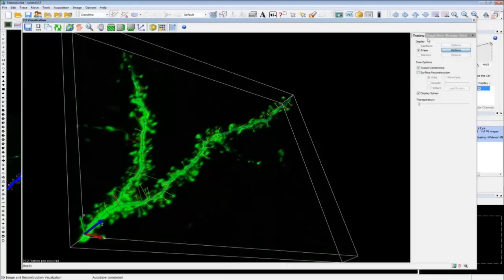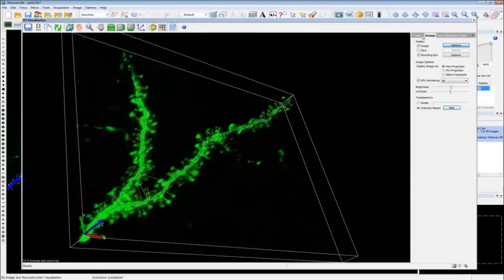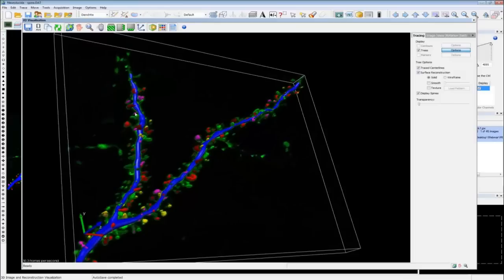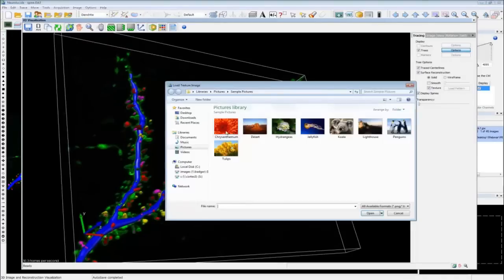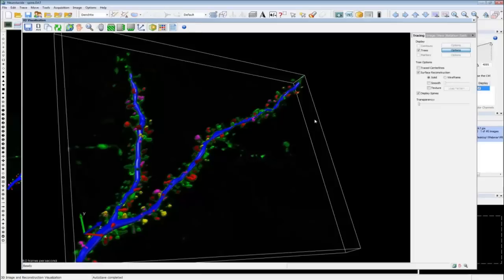For multi-channel image data, whatever channels you have displayed in the standard tracing view will appear in 3D visualization — disable channels you don't want before starting. Under the Tracing tab, do a surface reconstruction just like for contours. Now the tracing is overlaid on the image data. You can load a texture pattern for a fancier look, and choose to display or hide the spine data. You can also adjust the tracing transparency — increase it to see the underlying image data. If you want to hide the tracing entirely, uncheck the tree to hide both the dendrite and all traced spines.